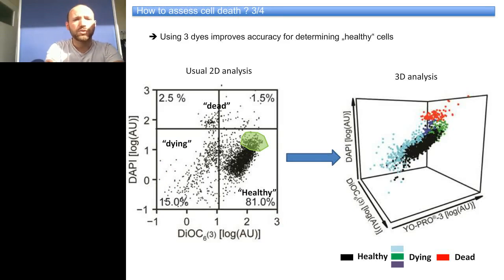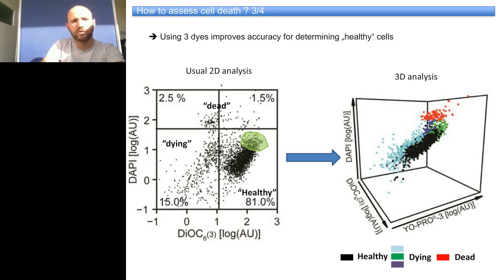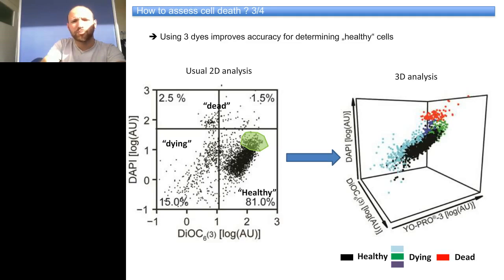This slide shows the necessity of using three dyes instead of two. On the left, you can see a typical standard 2D FACS analysis using DAPI and DiOC, where among healthy cells there are about 81% healthy cells. But if you add the YoPro dye to the same sample, you will see that population clustered as healthy is in fact a dying population — representing about 15% of total events. This means that 2D analysis can introduce wrong results by misclassifying dying cells as healthy.